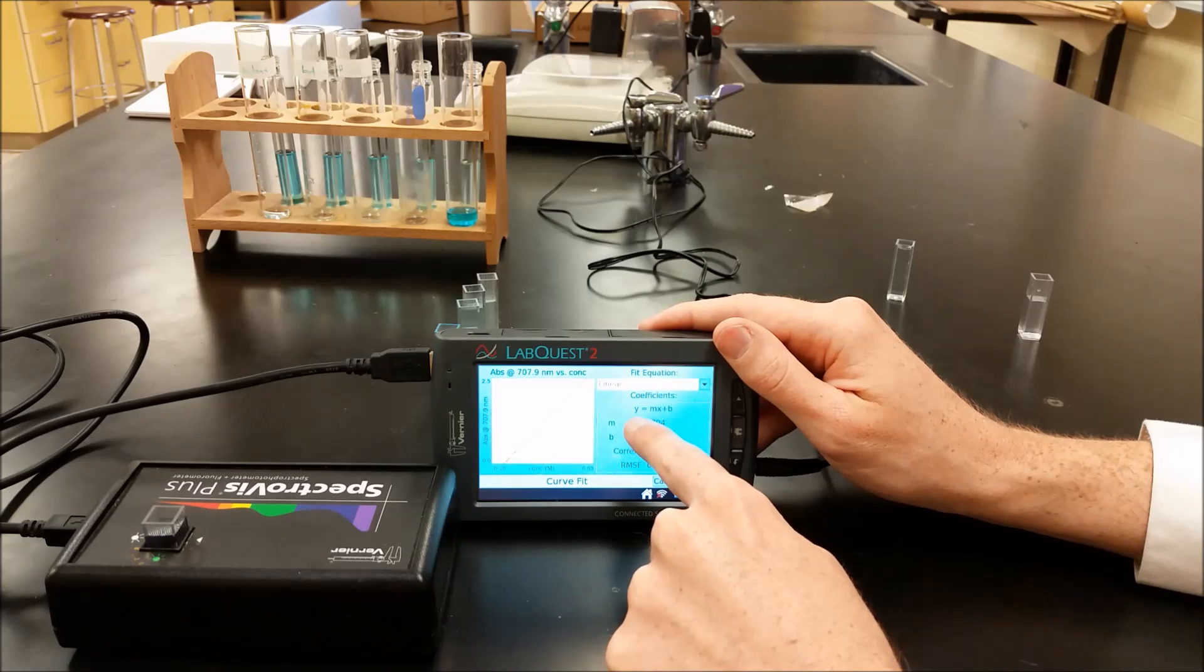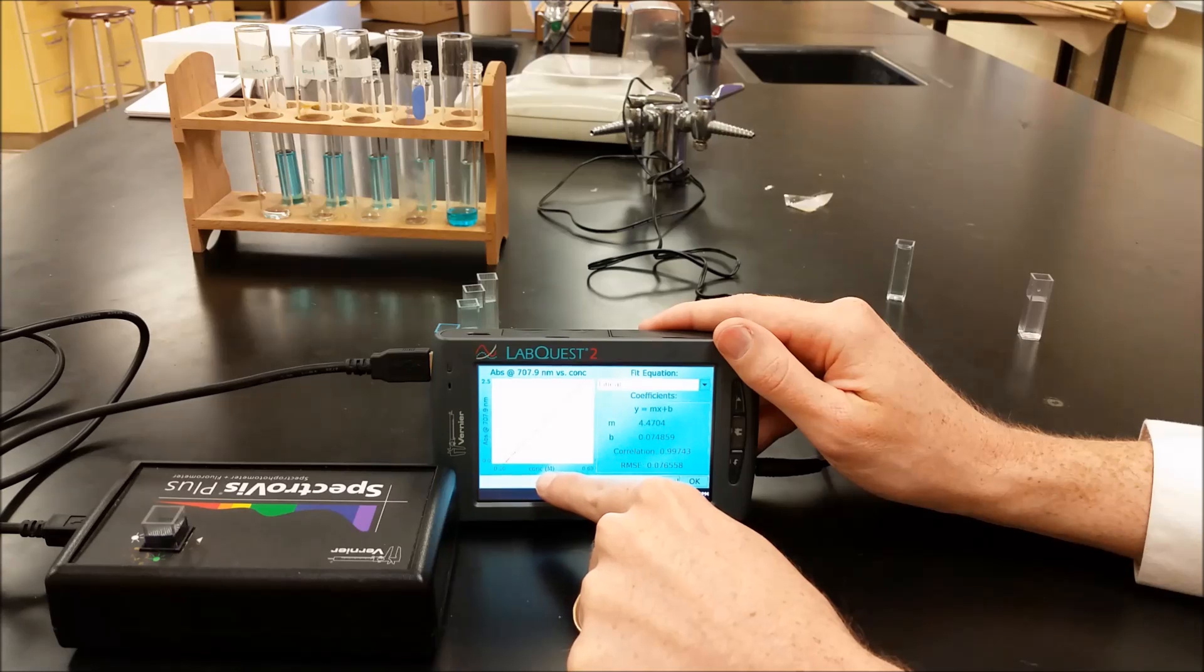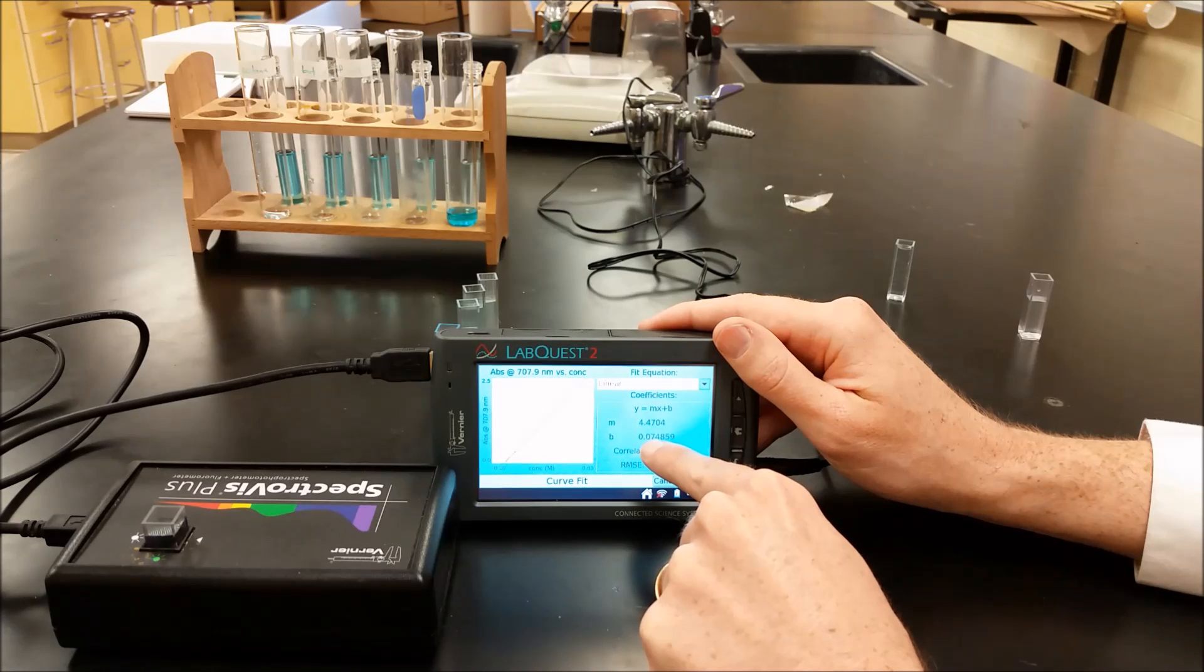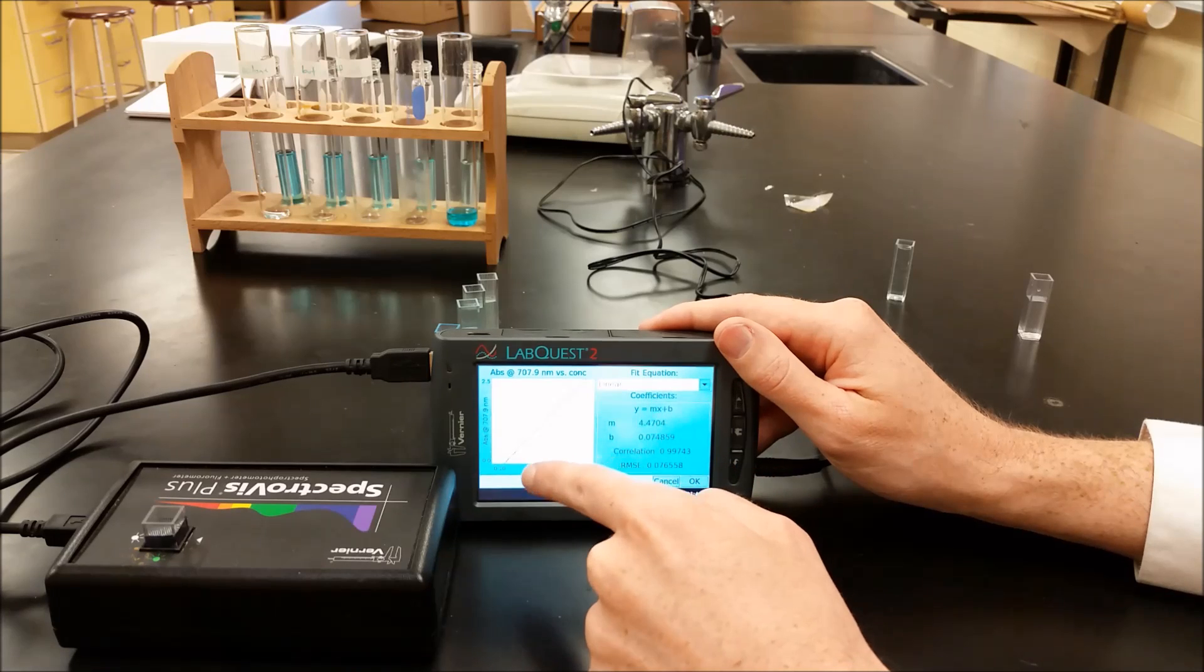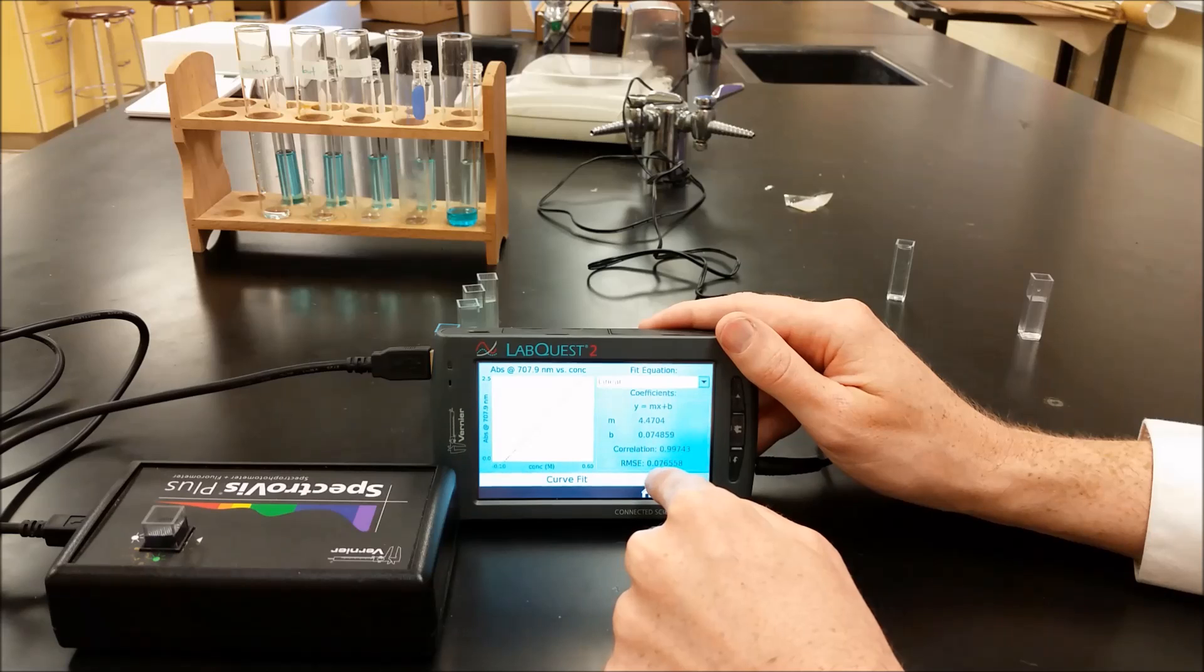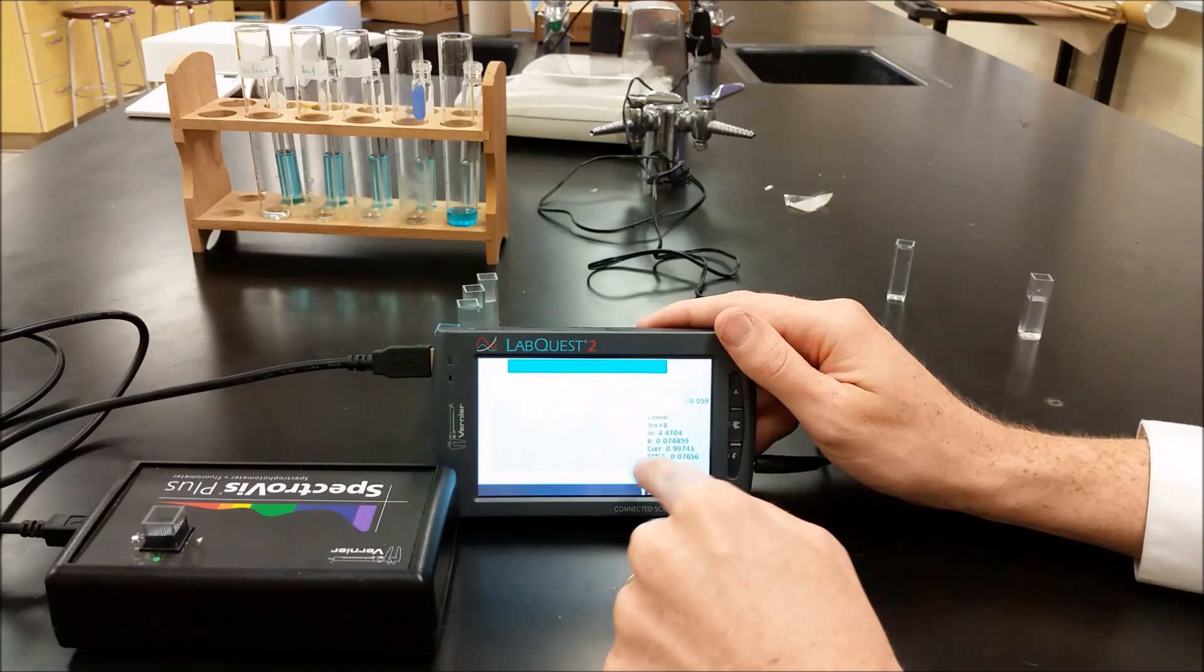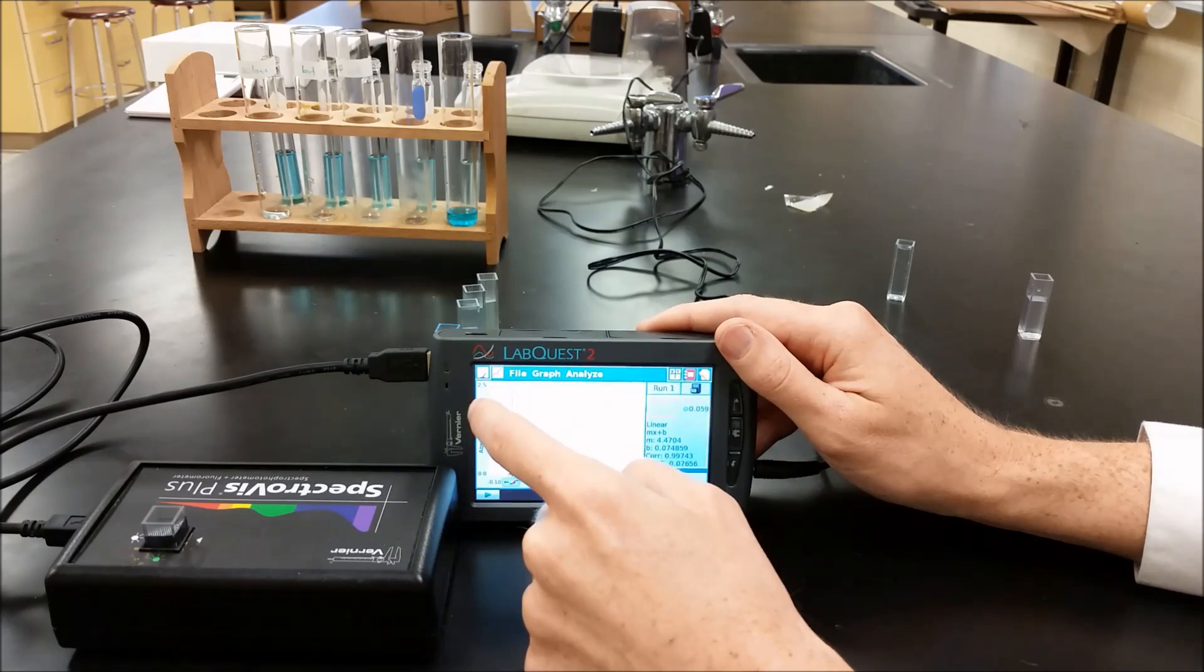So we get Y, which is the absorbance, is equal to 4.4704 times the concentration plus 0.074859. We know that it should be 0. So we should have a Y intercept of 0. That's not too far off from it. So we can go ahead and take that equation. And then the other thing we can do is we can go back to the meter here now.